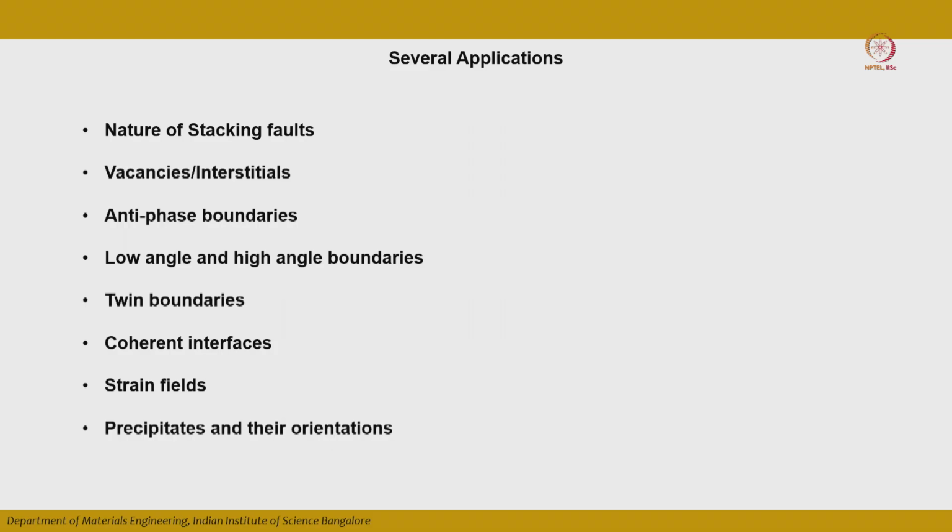In the last few classes, I have gone through some basics of the electron microscope, just to give a feel of what type of contrast you get in transmission mode and what type of analysis we can do. We have discussed the diffraction analysis, the diffraction contrast images, and also the stacking faults. These have several applications. You can study the nature of stacking faults, vacancies, interstitials, and antiphase boundaries, which have a different stacking fault. They have different planes and Burgers vectors.